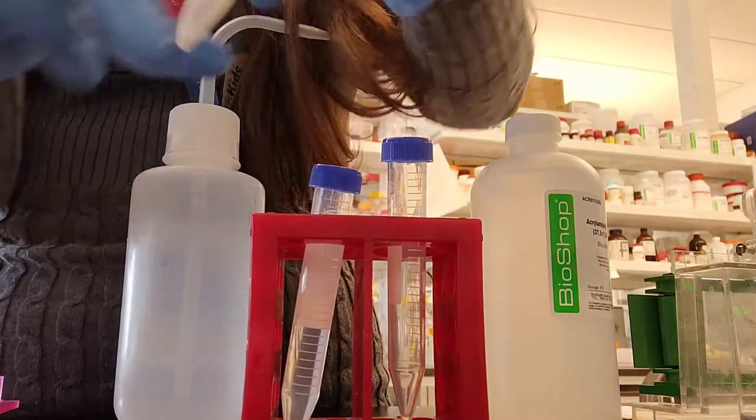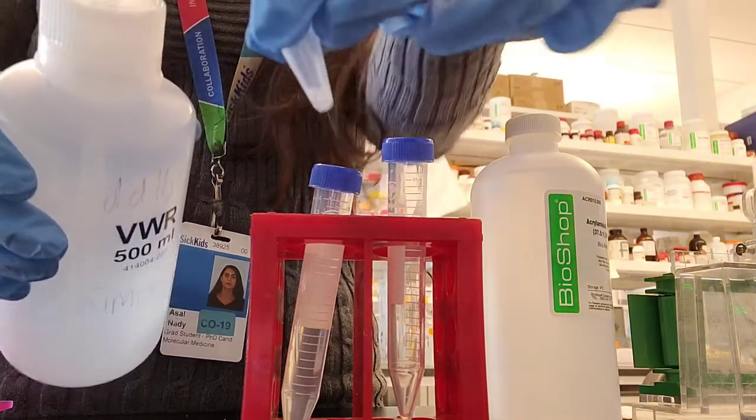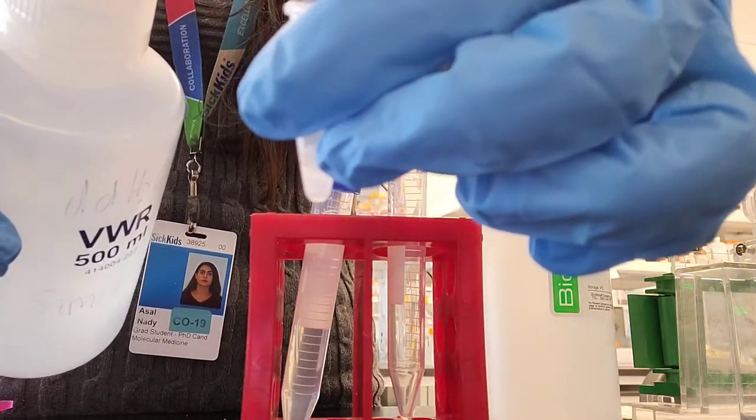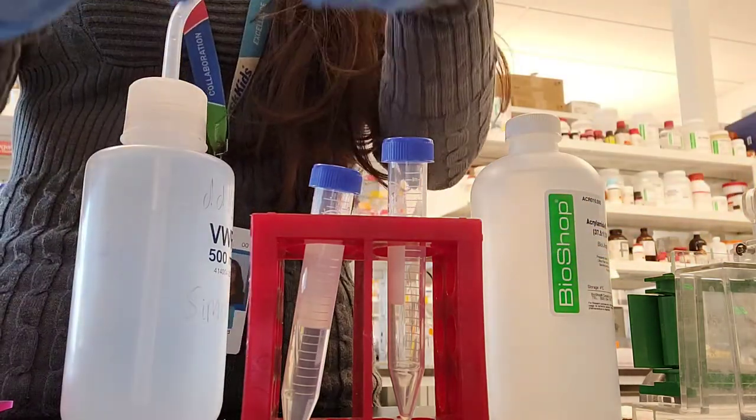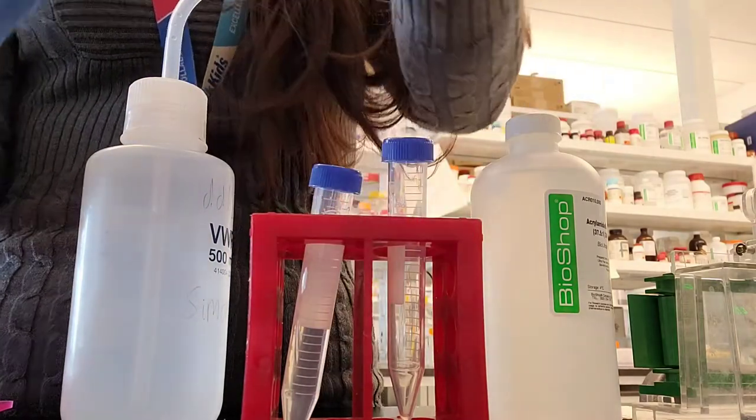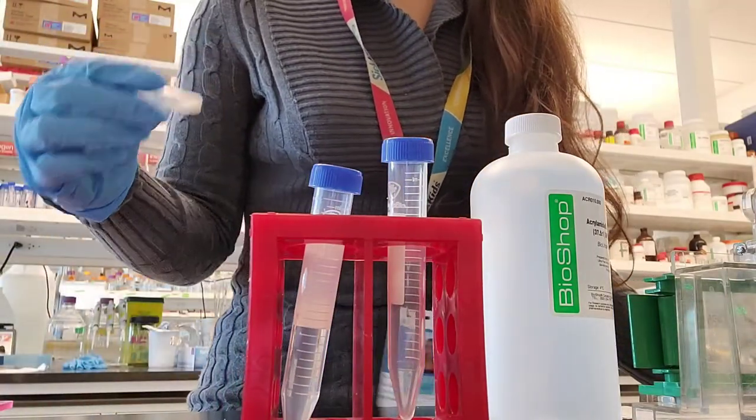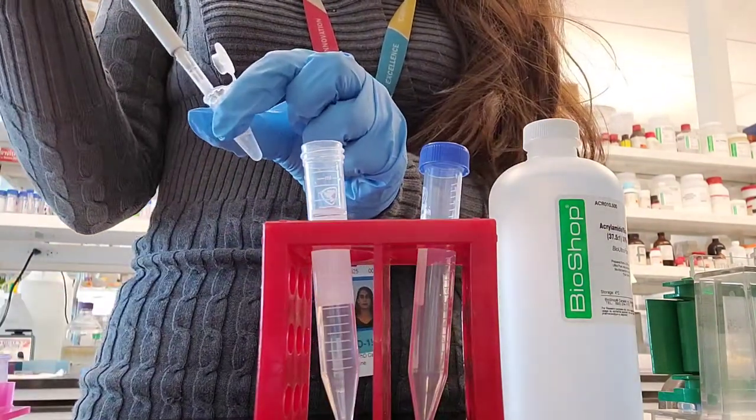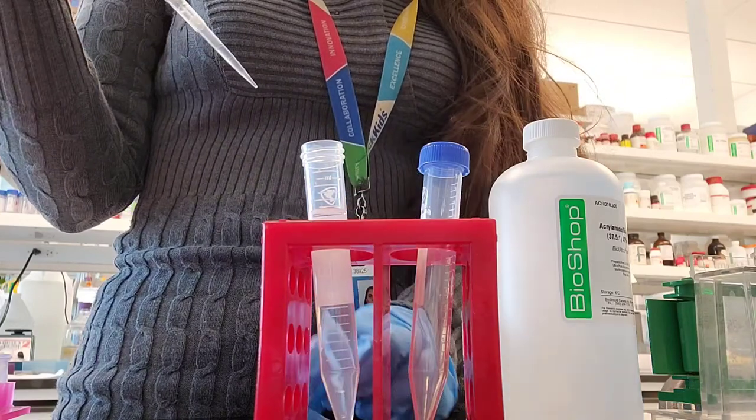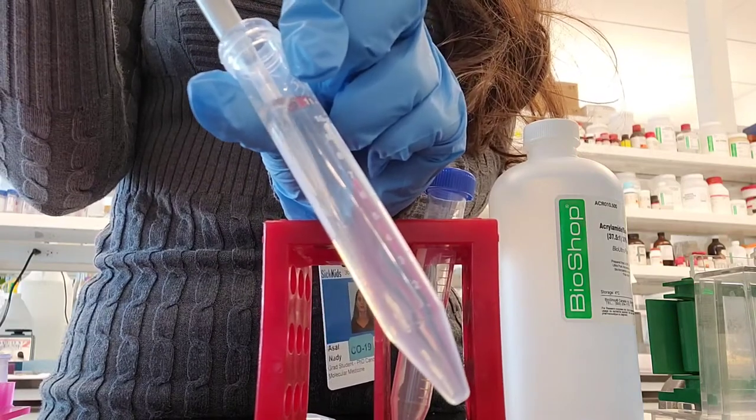Now I'm adding APS, which is one of the ingredients that will help with the polymerization process. I add about 0.02 grams to about 200 microliters of water, and this will give you about a 10% solution of APS. You want to make sure you make this fresh. If you use something from a long time ago it's not going to work and your gel won't polymerize at all.